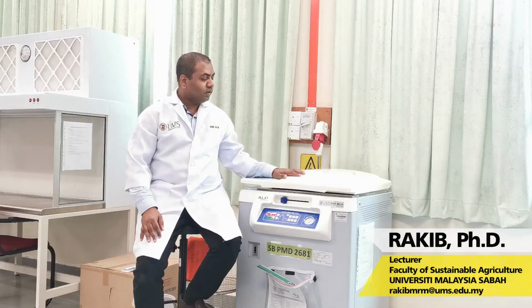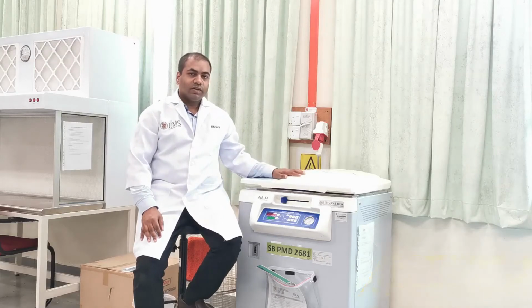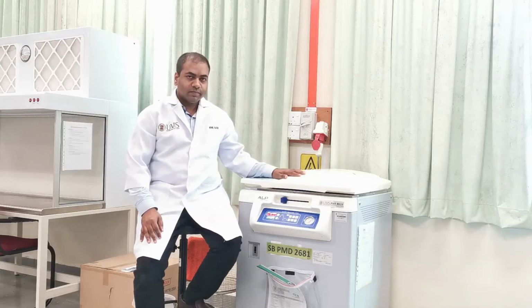After that, the media need to be sterilized using an autoclave. Miss Aubrey will demonstrate how to use the autoclave.